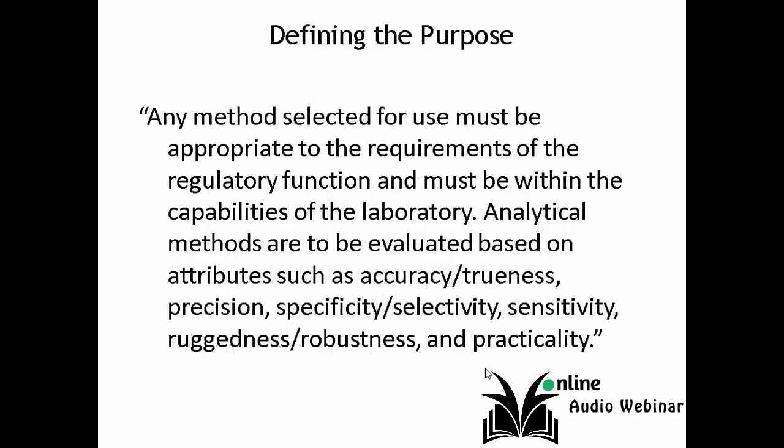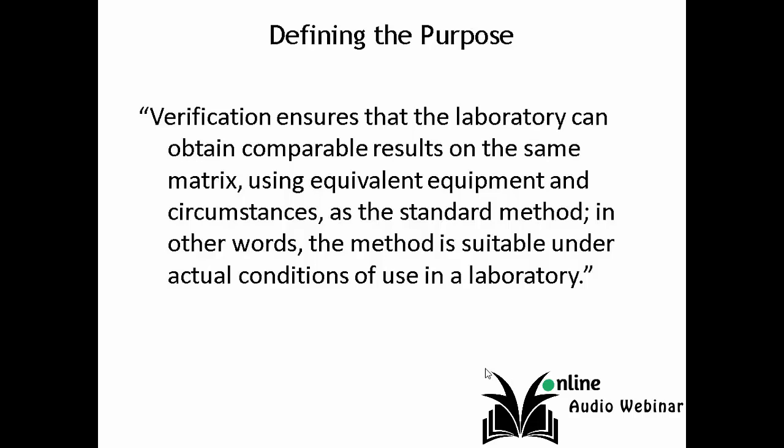As with anything under good laboratory practice, the purpose defines what is done, and that must be reemphasized on every step throughout all things. Verification or validation proves that the laboratory is doing suitable work as assessed by the Food and Drug Administration for that particular stage.